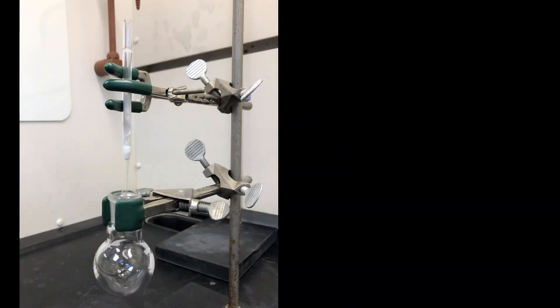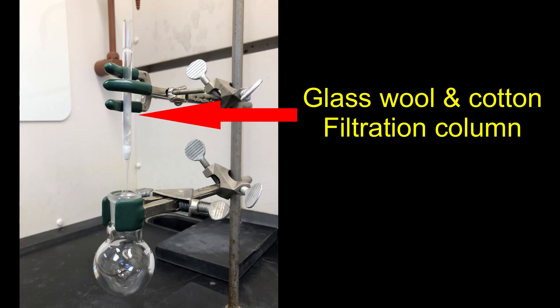After the reflux, cool the mixture in ice. The catalyst was removed by filtering the mixture through a pipette with glass wool and cotton inside.